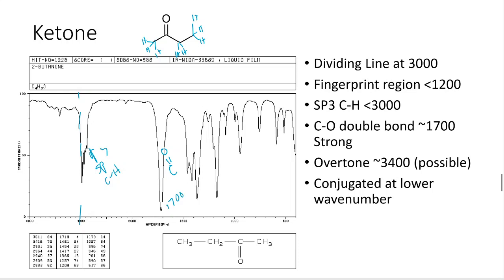1700. So this peak shows up characteristically around 1700 for carbonyls, and we'll often see at twice that number a smaller peak, which is due to that functional group absorbing twice the frequency of radiation, and that is called an overtone. So at twice that frequency, or double the wave number, we'll get what's called an overtone for that peak. And so it can kind of look like you have an amine, but really if you have a carbonyl, seeing an overtone is very common.